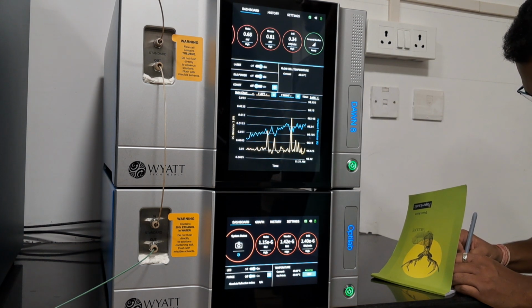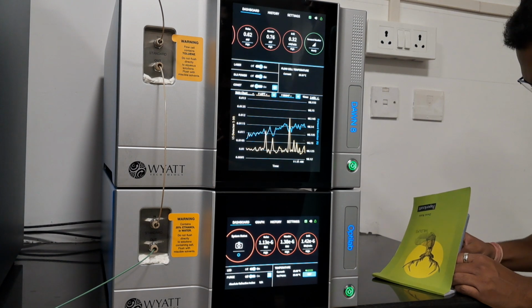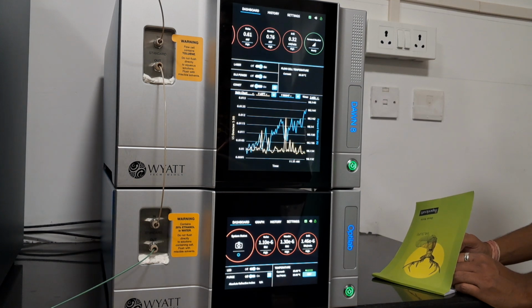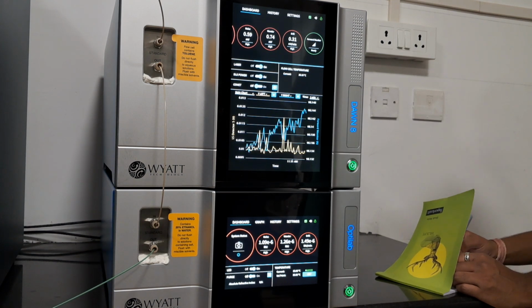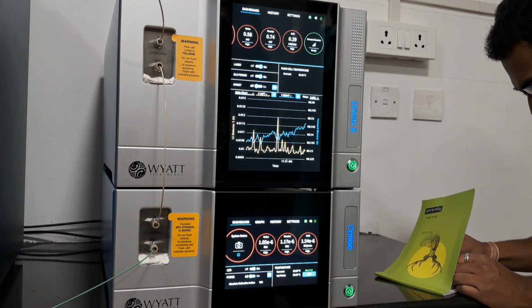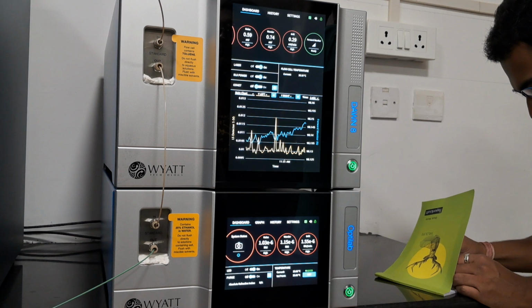But in that case, that will chalk it out, because the power is erratic, there are power cuts. So in that case, we can suggest you come at 9 o'clock in the morning, early. Before that day, you can prepare the samples.